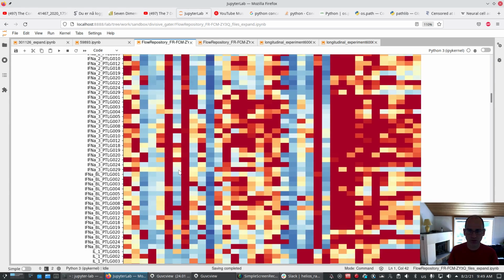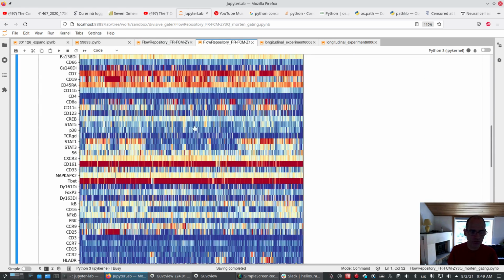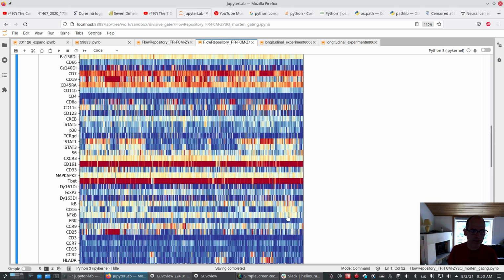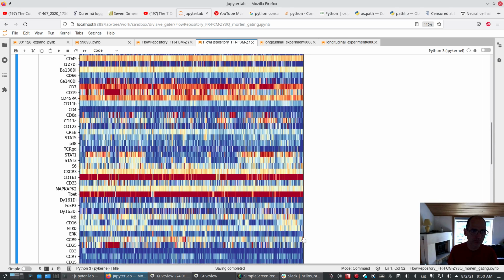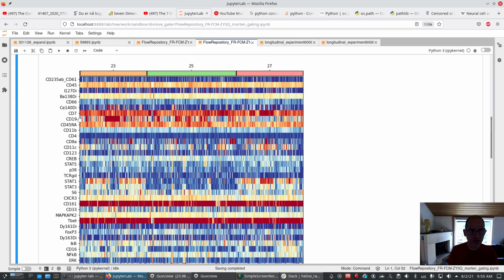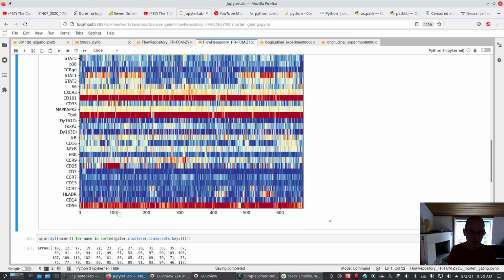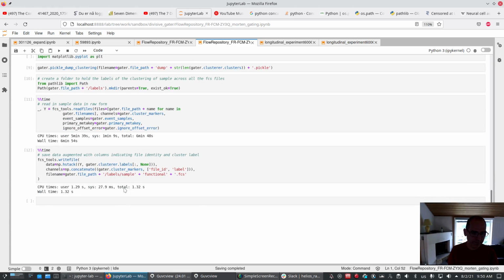So that was just one cluster. CD56 was kind of one of the markers I have an understanding about. This means these are natural killer cells, and there is no CD3, so they're not T cells. CD19, well, they look a little bit like B cells, but not quite. It's only this part that is sticking out in the one cluster, 23, that also has CD25. Okay, and that's it. Have fun with the illustrations.